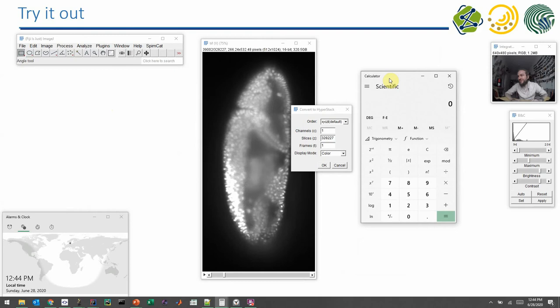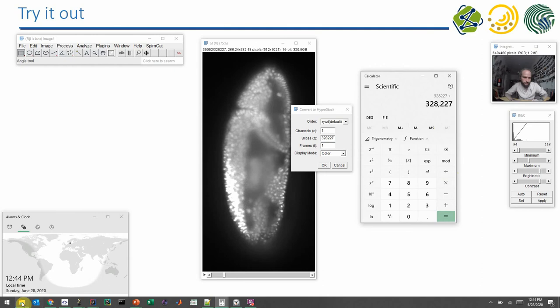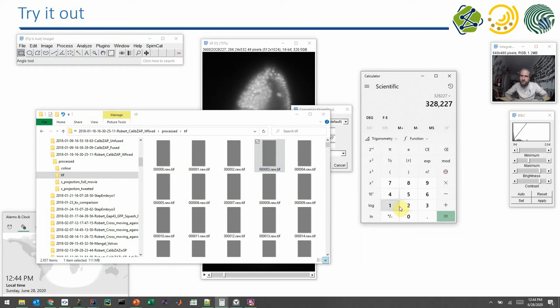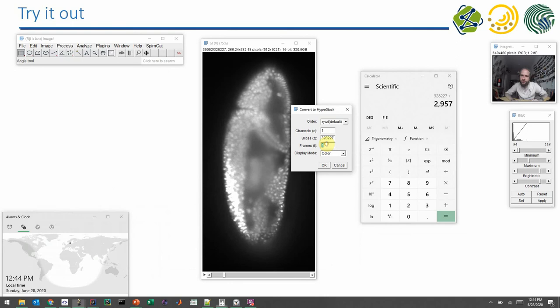With a simple calculator, you can calculate the correct numbers. I will take the 300,000 files and divide them by the number of files in this folder, which is 2957. I can enter 2957 in frames, because this is how many time points we have. If I divide the original number, I get out how many slices per stack we have. Then I click OK. This takes no time.